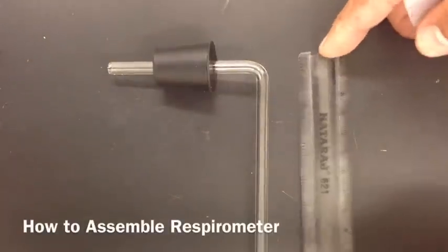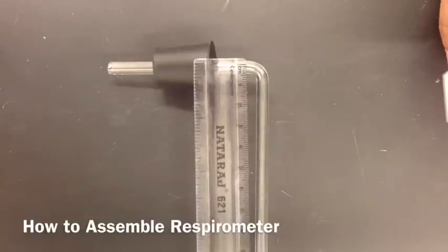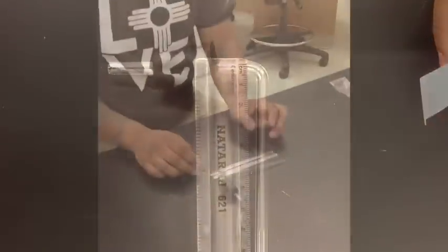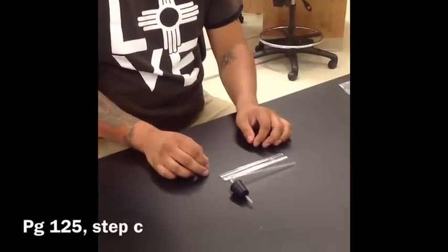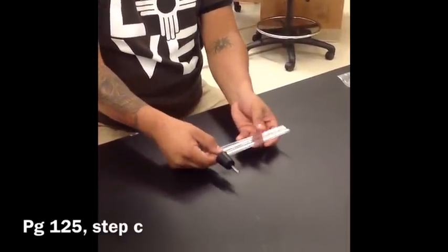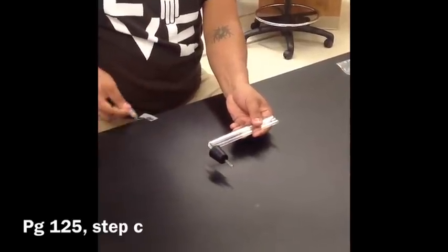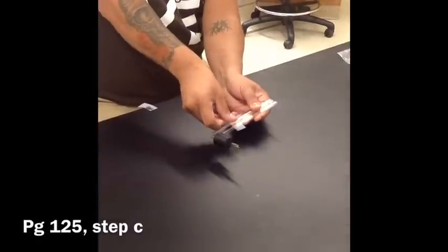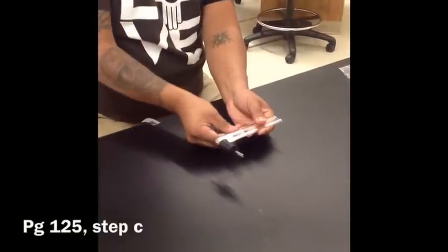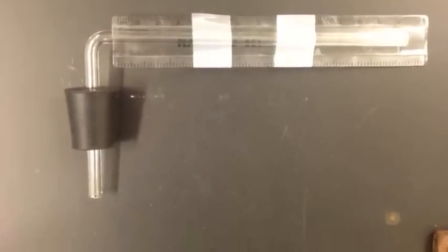Let's assemble your respirometer. Refer to page 125, step C at the top of the page. Affix the ruler metric side up with clear tape to the long section of the glass tubing. The increments on the ruler will be useful reference points later in the experiment.